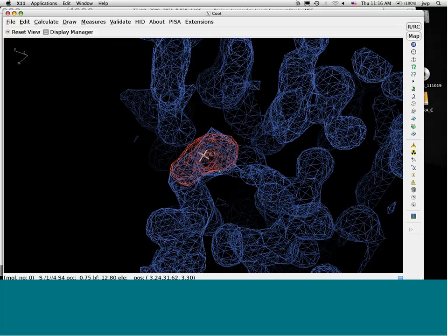So ARCA actually commented on her twinning. It's non-merohedral twinning. So it's like a cracked crystal, yeah.